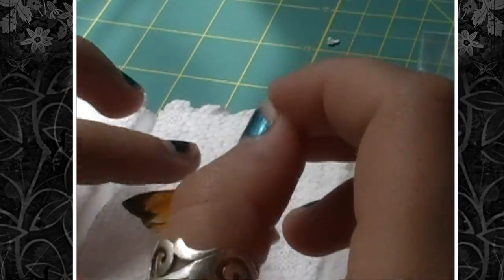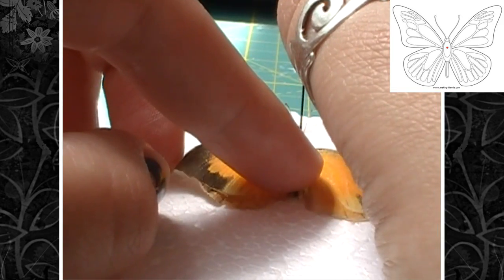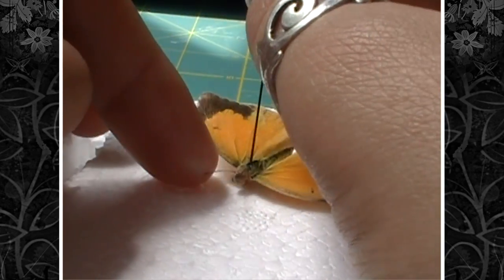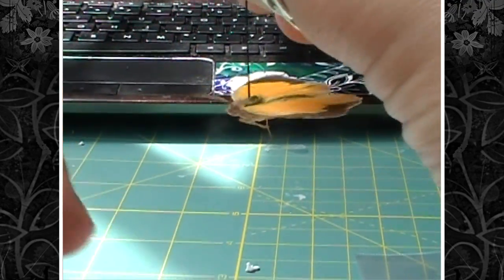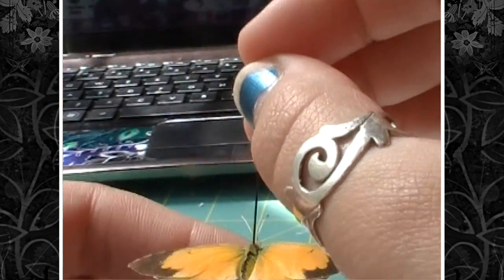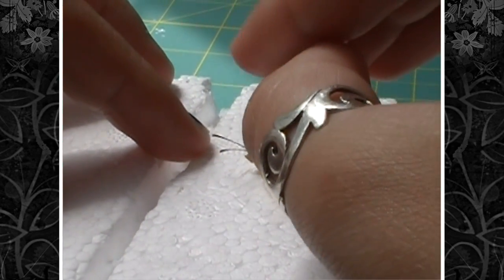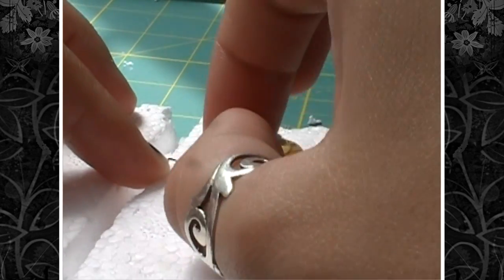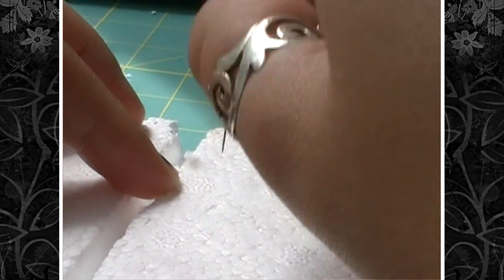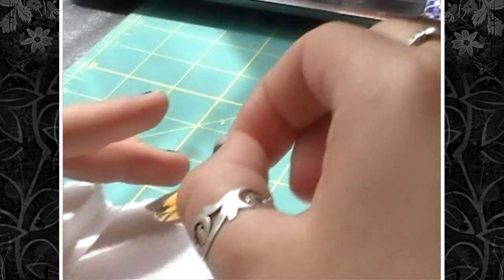Since this is a butterfly, you're going to pin him through the thorax — through the middle of the thorax — and you're going to make sure that he's as straight as possible on the pin. Once you have him how you like him, you're going to push the pin the rest of the way through. You can use your pinning block to determine where on the pin he should be, but I just eyeballed it.